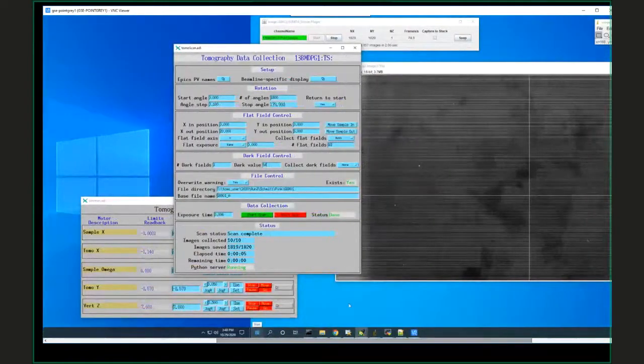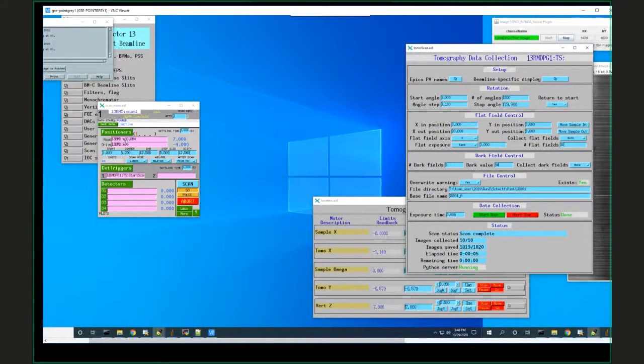And basically just do the same scan that we did before. If it's really going to end at 12.5, it should be 4 points. Oh no, I see the problem. I was doing a relative start position and an absolute end position. That's the problem. I want to do the relative end position is 5.5 times 3, which is 16.5, right? There we go.